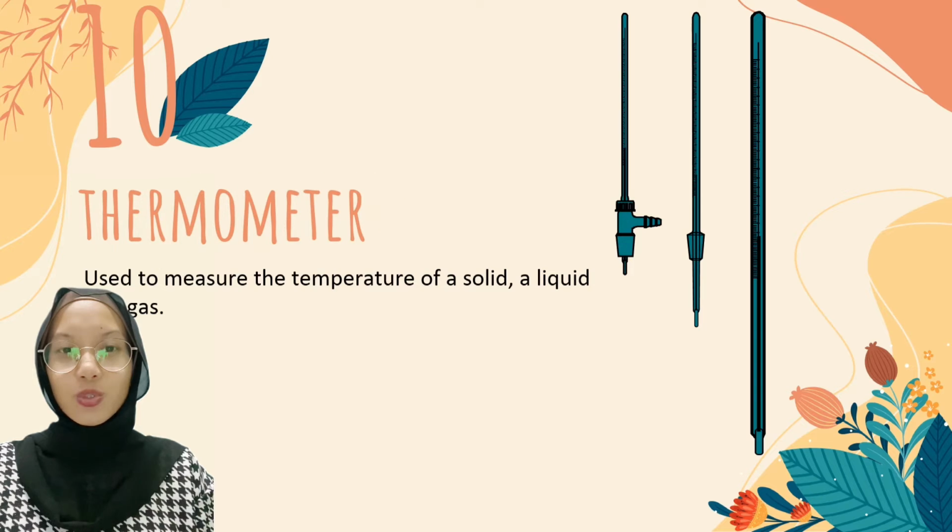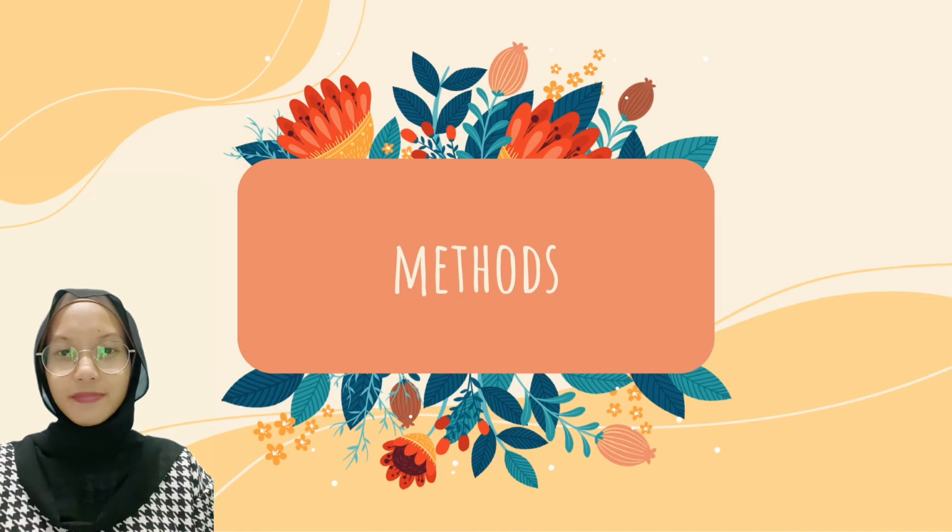Thermometer is an instrument that measures temperature. It can measure the temperature of a solid, liquid, or gas. The common units of measurement of temperature are Celsius, Fahrenheit, and Kelvin.